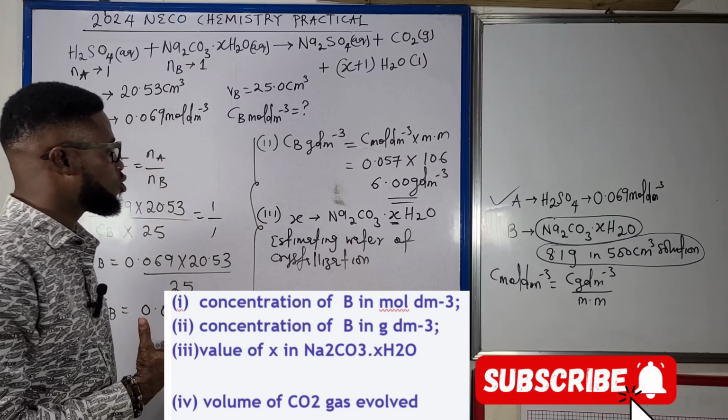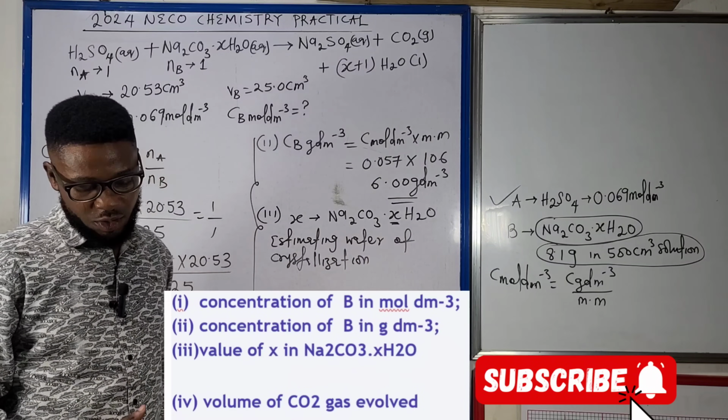This is about estimating water of crystallization, and there is a formula we used for that.